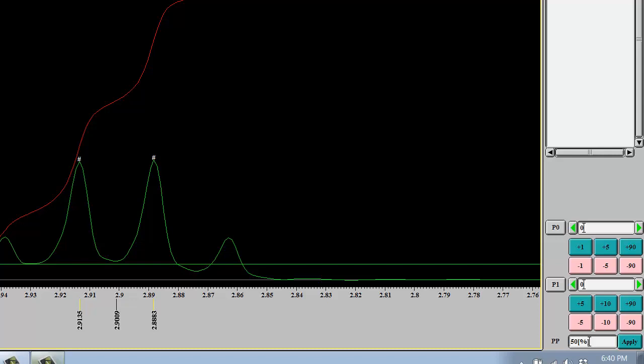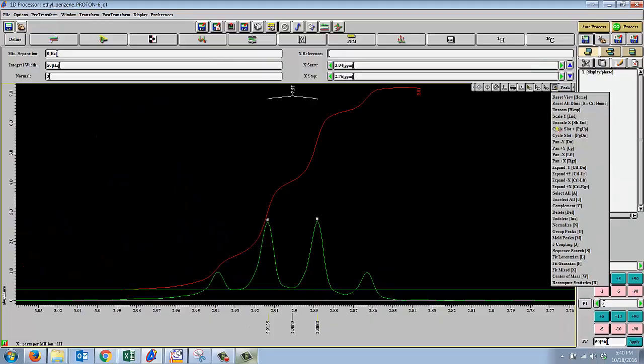The J is 7.57 Hertz between these 2 peaks, which makes sense because A is coupling to B and B is coupling to C, and so their interaction with each other is showing us that they are giving us that same frequency. We can also find J coupling in the peak picking option; if you scroll down you can see J coupling. If you're in version 5, more than likely the easiest thing for you to do is click the J key.